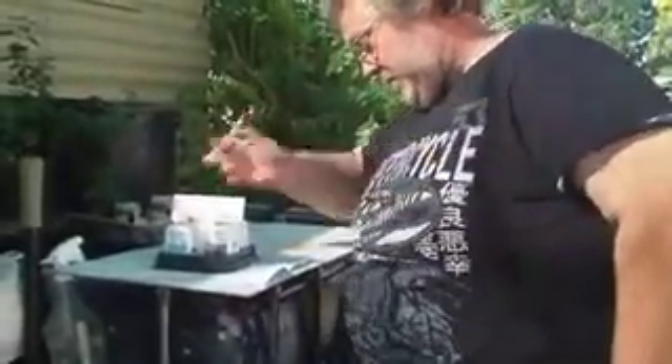Now cap the test tube and shake vigorously for five seconds. Do not hold your finger over it. My kid says, 'Dad, I think they mean the test tube.' Two, three, four, five.